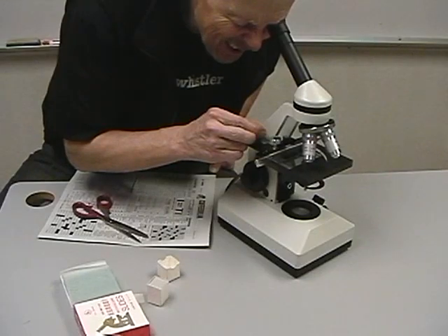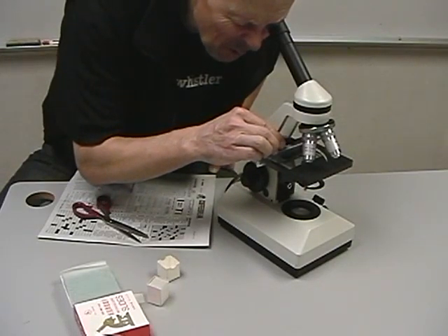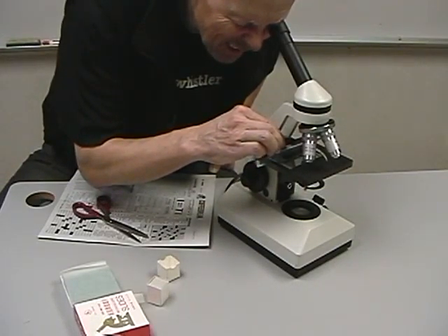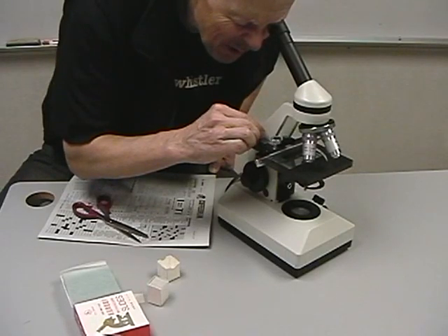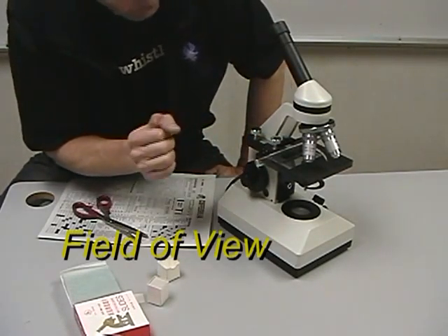I need to slightly adjust the position again very carefully. It tends to move quite rapidly, as you'll find out, and there it is, perfect. It fills the entire medium power field of view.